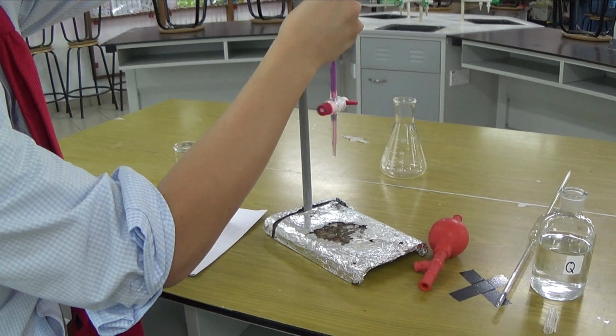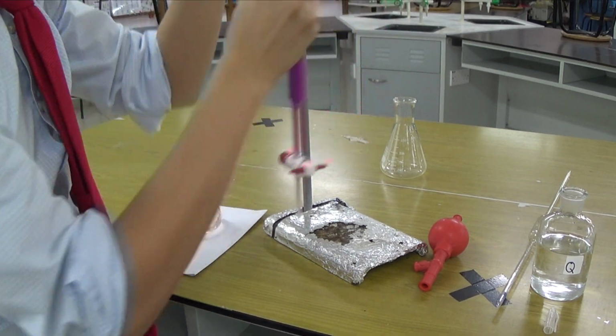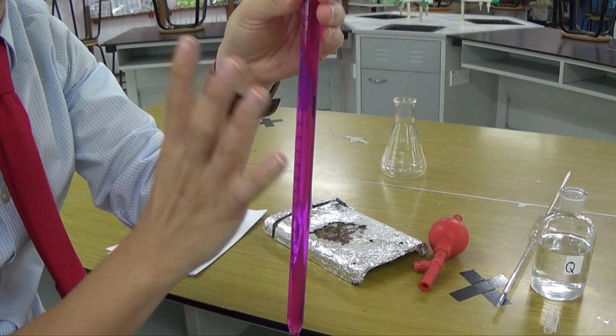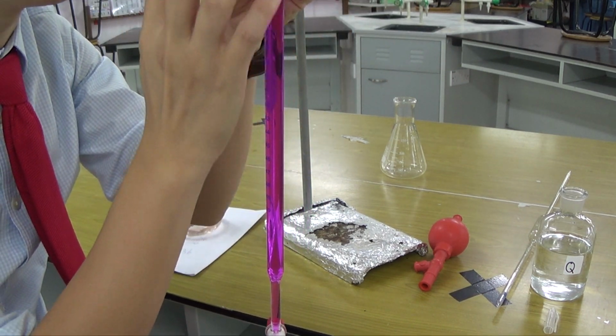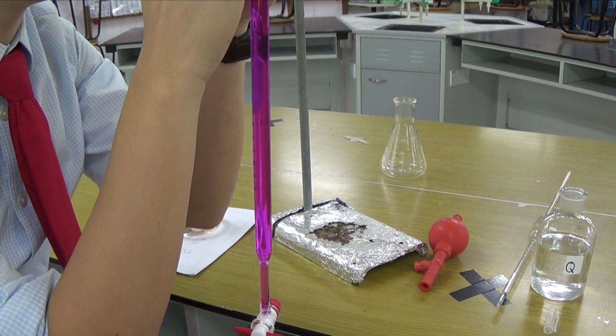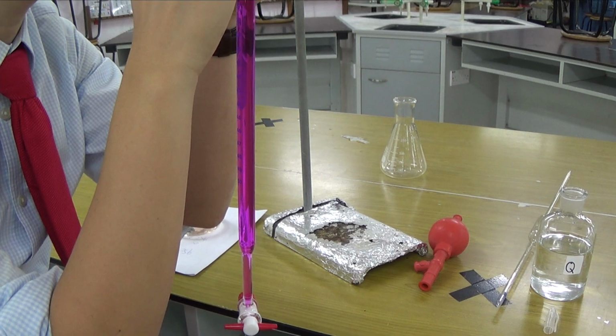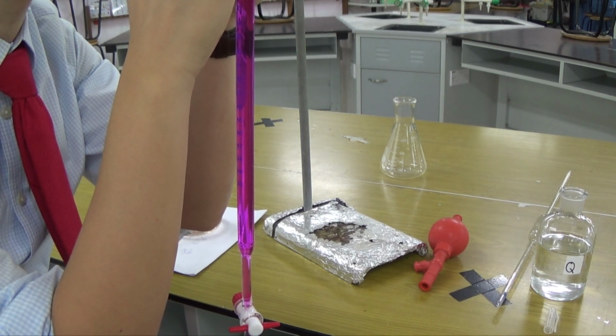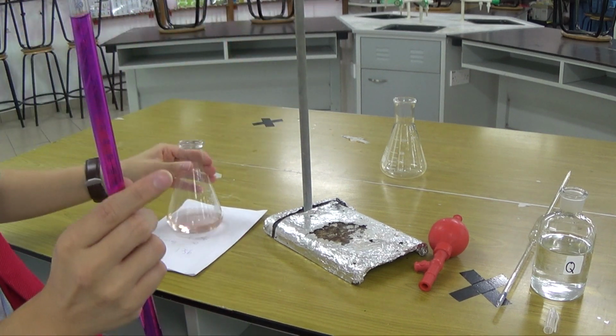If I read the reading first, what do I have? I'm reading above the meniscus because this is supposed to be a dark color solution. It's quite hard to read. We always read above the meniscus. Give me a minute. We read above the meniscus: 23.3 cm cube.